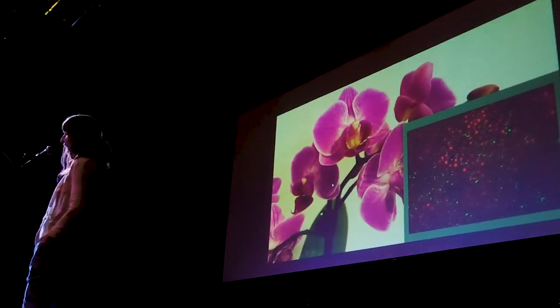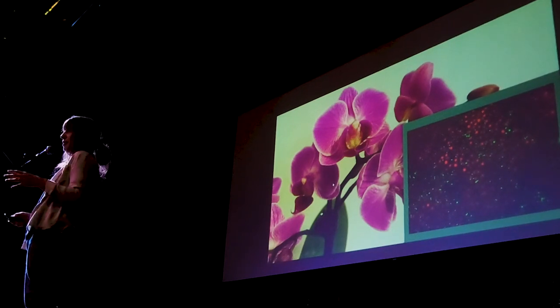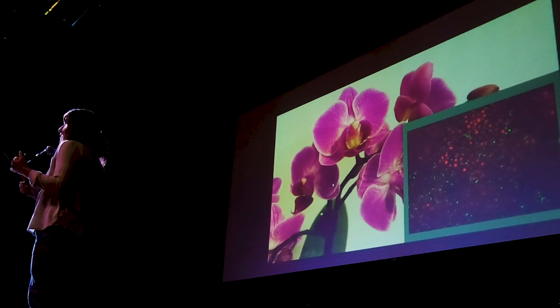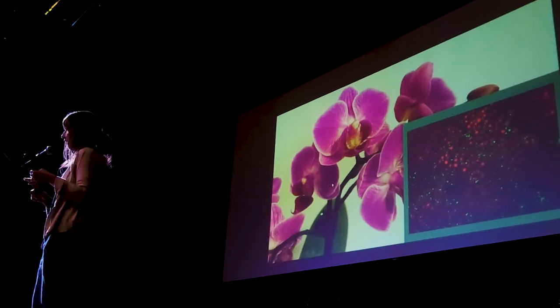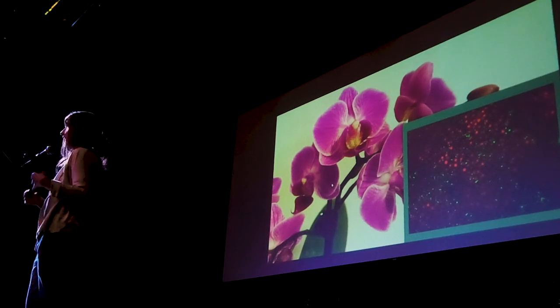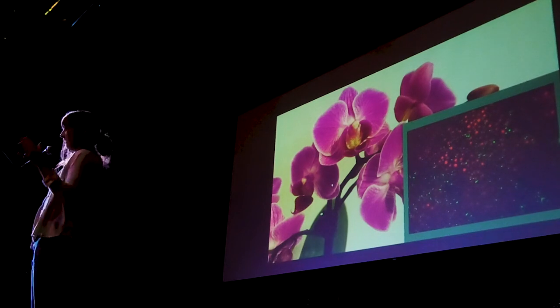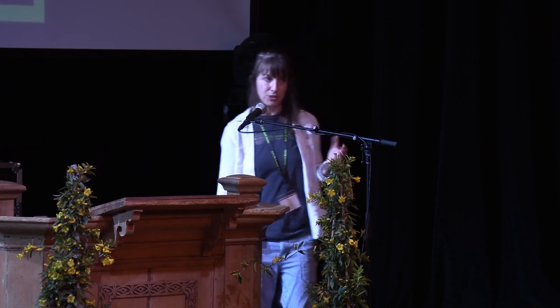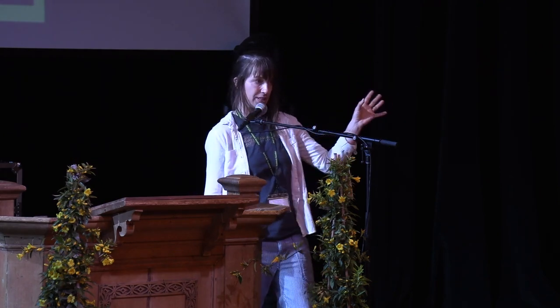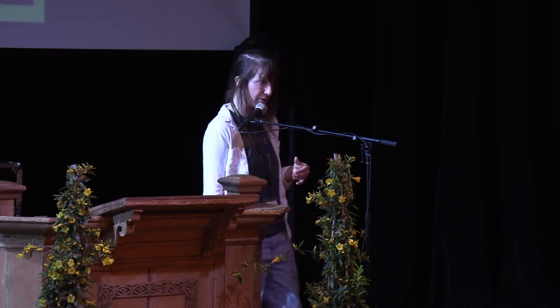So another thing that we can see, another association, interaction with microbes that we can see with the microscope is mycorrhizal colonization on the roots of our plants, and also microbial colonization of the leaves. And so later we're going to get much deeper into compost teas, compost extracts, all the tools that we use for the work that we do. But with compost teas, you're going to be spraying them onto a leaf surface, and you want to make sure you get good coverage. And so one of the tools that we have to make sure that we're getting good coverage is an epifluorescent microscope.